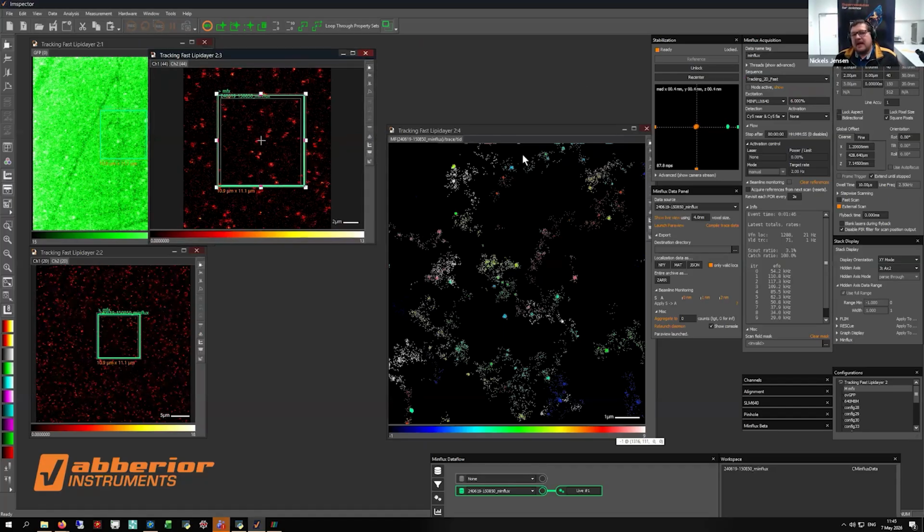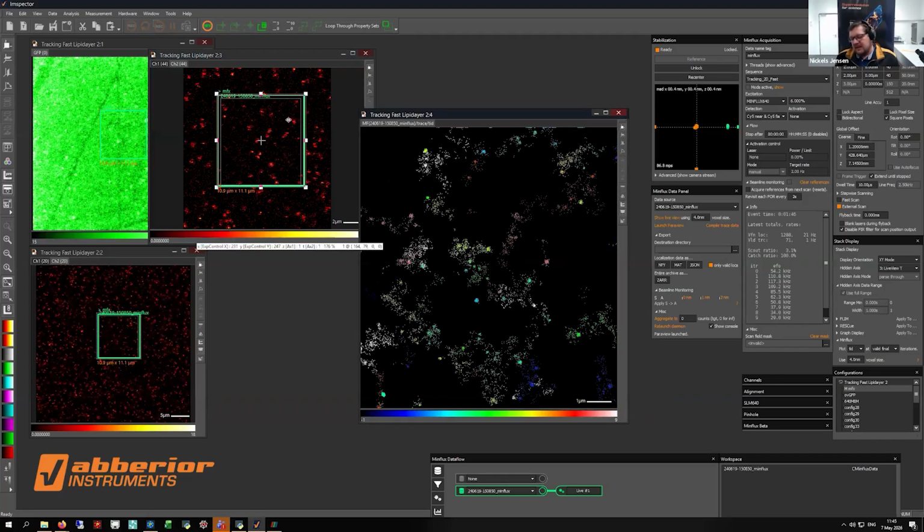I start the measurement, and the system will scan as it did for the imaging, and whenever it finds a molecule, it will just follow it. It will reposition very fast with our EODs and the Galvo. And as Evelyn already said, it can be done with a speed of about 100 microseconds per time point, meaning we are 100 times faster than any camera-based system. And we get down to a localization precision, when we are very fast, of a bit above 10 nanometers.